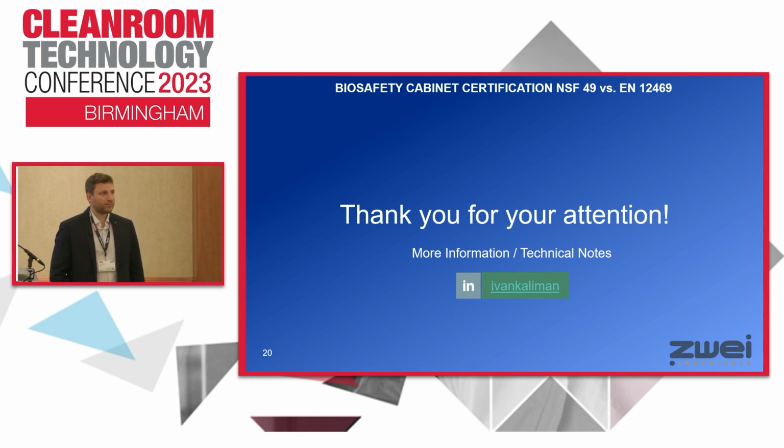Yes, I appreciate there are differences. That's why there are two standards. There is not an ISO standard yet for biosafety cabinets. I don't think there will be one very soon either, but there is a destiny, I hope, where NSF 49 and EN 12469 will converge. Martin's in the room.